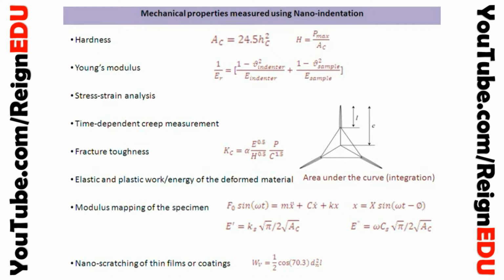These are the various mechanical properties which can be measured using nano indentation: hardness, Young's modulus, stress-strain analysis, time-dependent creep measurement, fracture toughness, elastic and plastic work or energy of the deformed material, and modulus mapping of the specimen, that is, how the elastic modulus changes from one place to another in the sample. Also, nano scratching of thin films and coatings can be done.